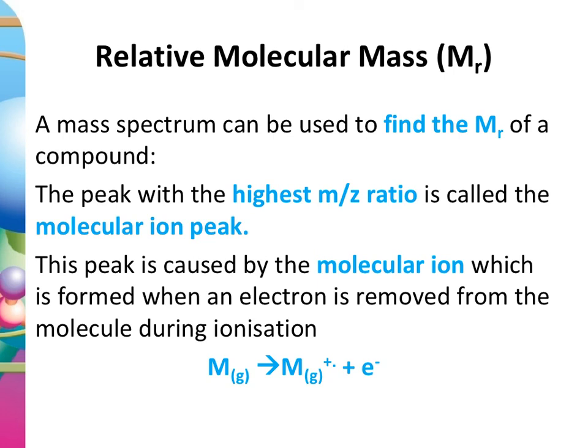So that will be the peak that corresponds to the molecule. It's one way of discovering the mass of the molecule that you've put in as the sample. You may not know the mass of the molecule that is your sample, so you can use mass spectrometry to do that.